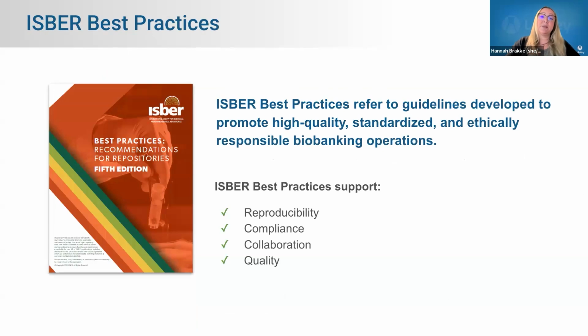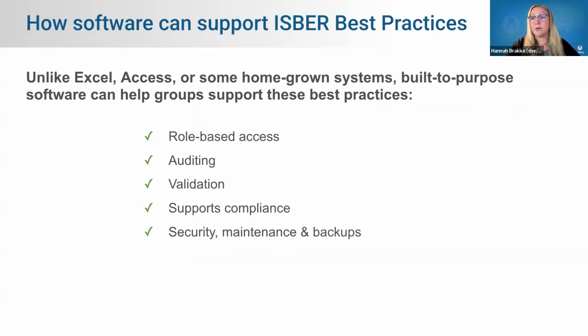By following these best practices, biobanks can strengthen the key pillars of their operations: providing reproducibility in research, ensuring regulatory compliance, having seamless collaboration within the biobank itself, and improving their overall specimen quality. Today we're going to explore how software, specifically LabKey software, can help biobanks align with these goals in a practical, scalable way.